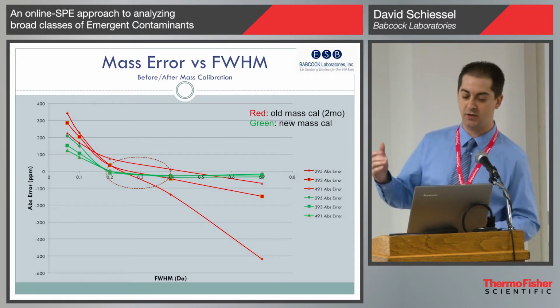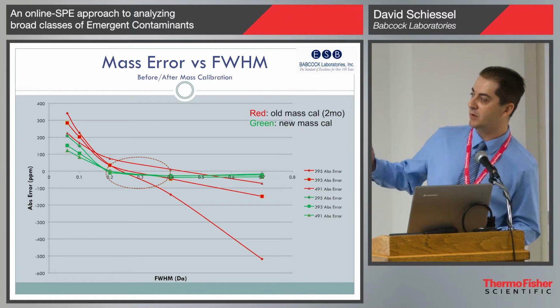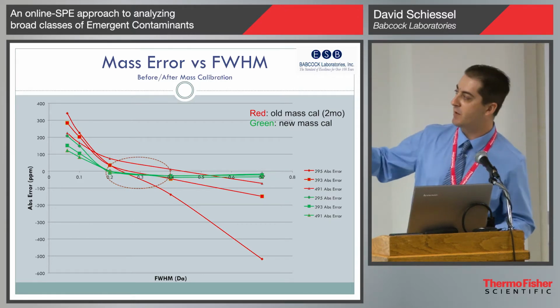This is showing that the red is before mass calibration.